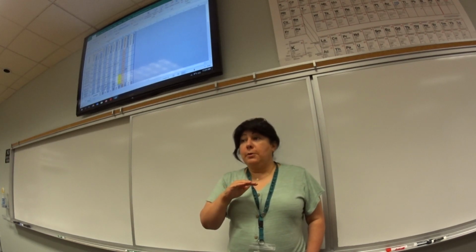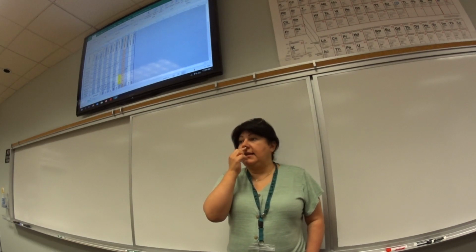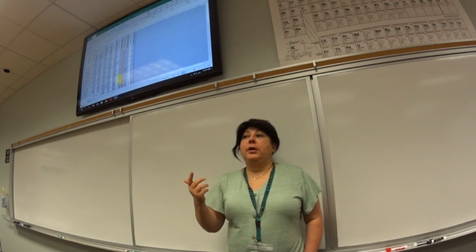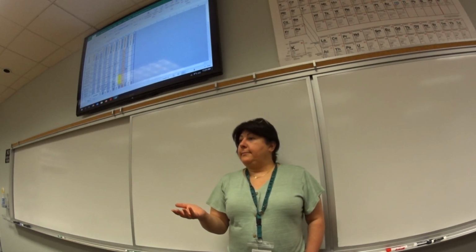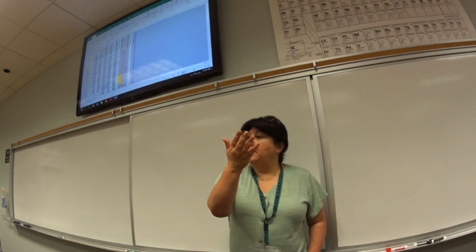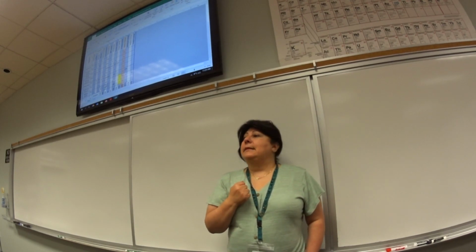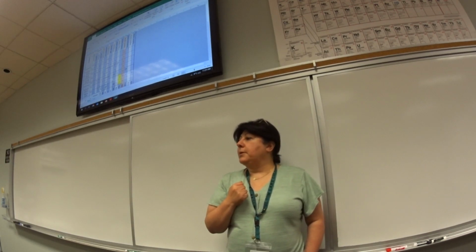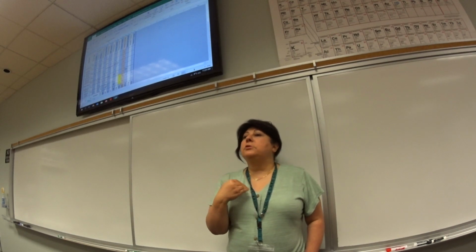So once you're completely sure, you come to me on Wednesday and you say, Sina, my unknown number is unknown number 5, and I believe it's gram-positive cocci. You can ask me to come and look at your slide. Then I'll look at my list and I'll say you're correct, you are a gram-positive cocci. That I will confirm.